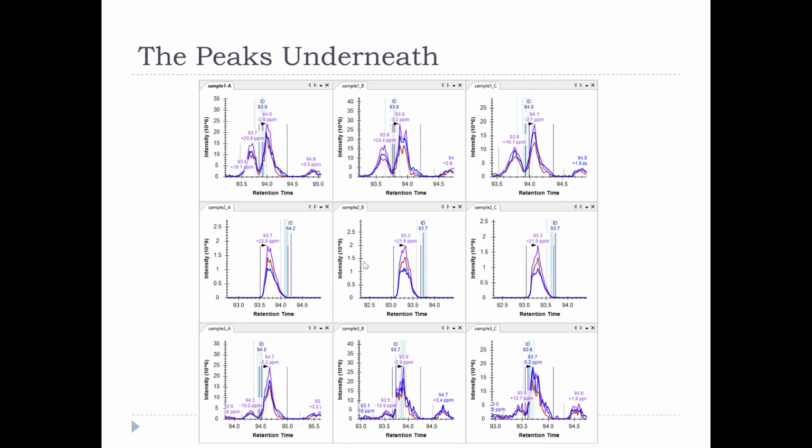So in this case, here we go, okay, again, it gets ID'd in every run. But what I like to talk about is something called the chromatographic landscape. When you don't have just perfectly one peak, frequently you can learn something from the other peaks you see. And in this case, there are 2 peaks, and we pick the one to the right, and there's an ID in it.